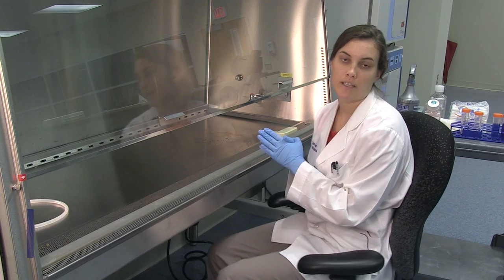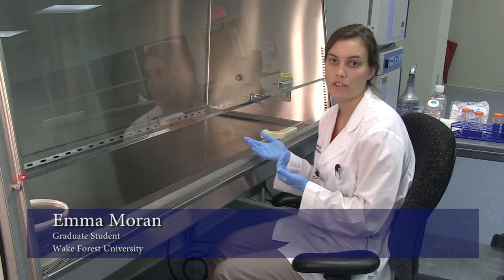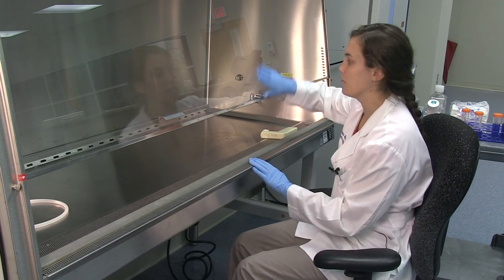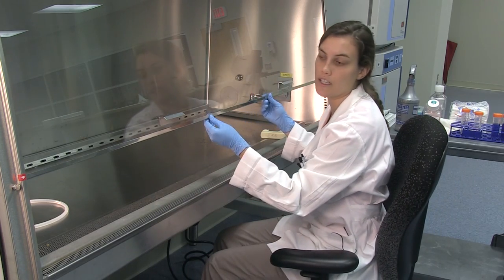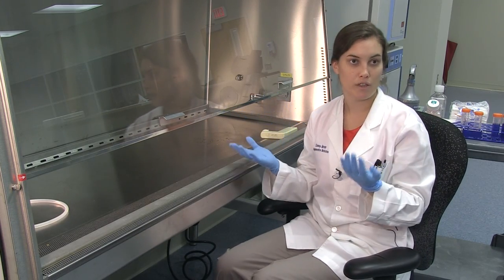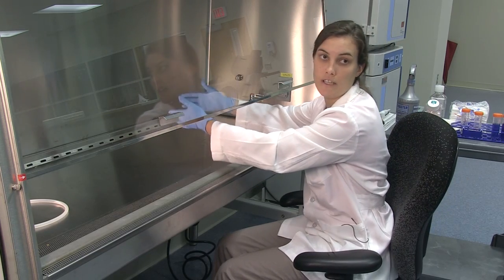Today I'm going to be talking about aseptic technique, which is used to maintain sterility when working with things such as cell culture to prevent contamination of your samples. This is done in a laminar flow hood. You move the front of the hood up — there are usually marks or indications of how high it needs to go to maintain proper airflow inside the hood. Another important thing is to always wear gloves and a lab coat so that everything going into the hood is sterile.